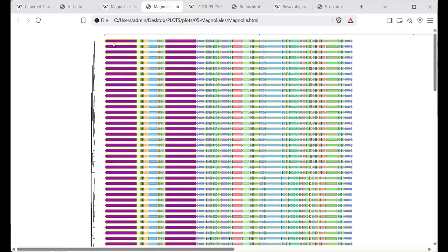Which block is picked randomly. There is no fixed location in the context of these LSC, SSC, or anything, but they all start from the same PGR-TK aligned block, and then I rerun the software again.